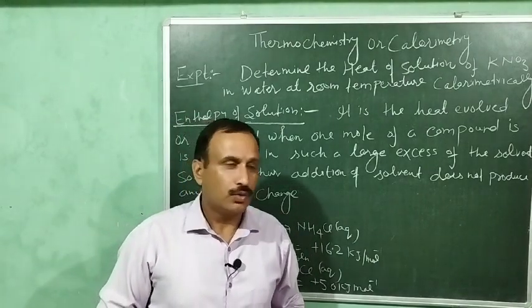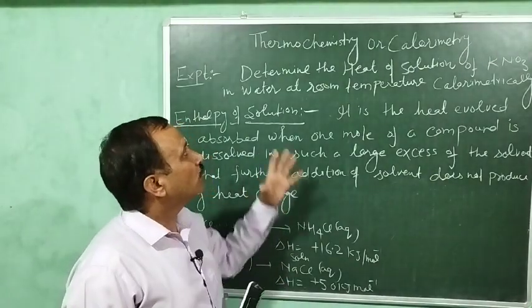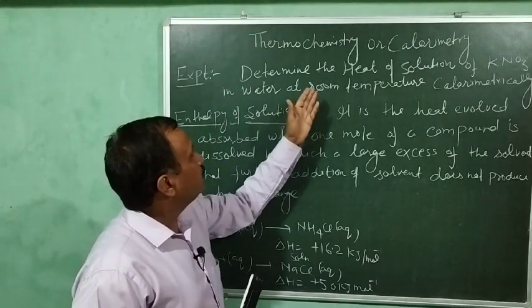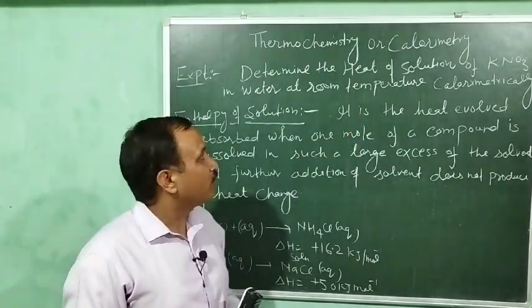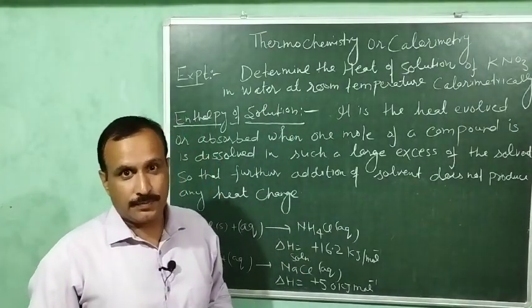And in this video, I am going to discuss another experiment related to thermochemistry. The experiment is: determine the heat of solution of potassium nitrate in water at room temperature calorimetrically.